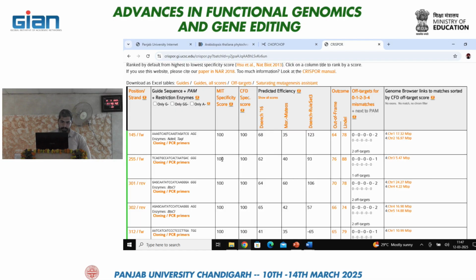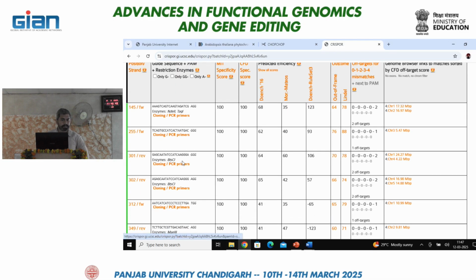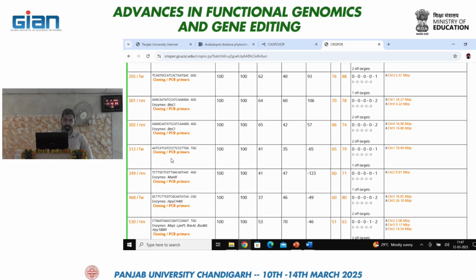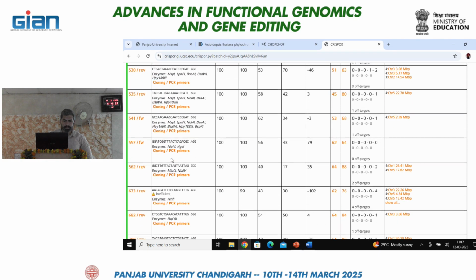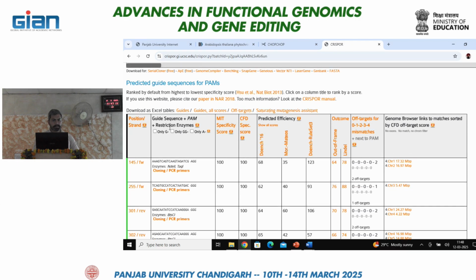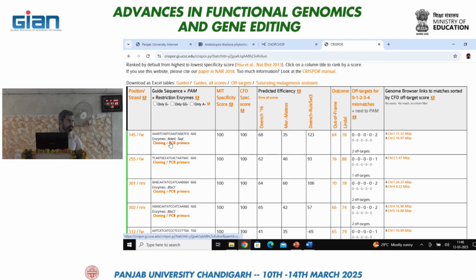Besides this, it's also providing the enzyme sites which are present in the target region, that could be helpful while designing the primer specific for that, or you can just simply skip it. When you design the vector, when you insert this target gene in the vector, you don't want the same restriction site for which you will be digesting the vector. So you can check that also, and this tool is also providing the enzyme sites present in the sequence.